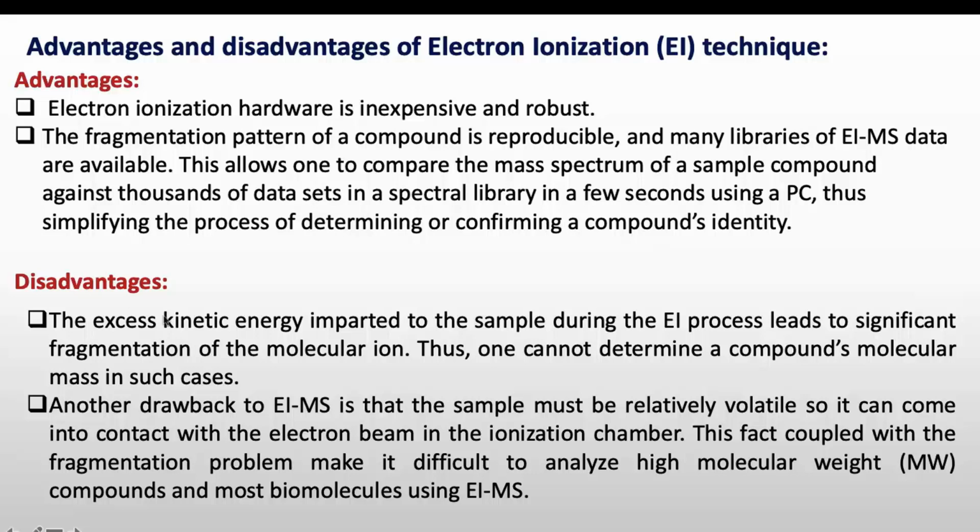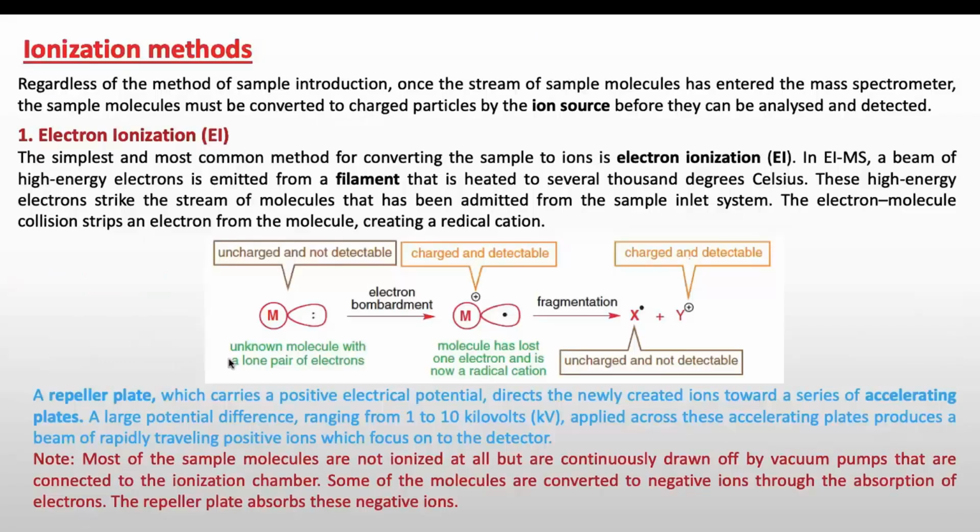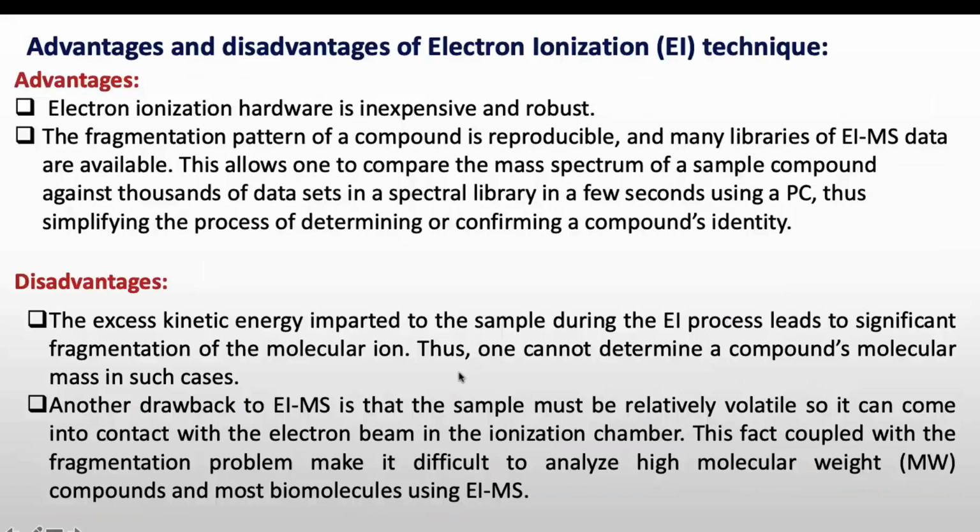But this method also has a few disadvantages. The excess kinetic energy imparted to the sample by the electrons during the EI process leads to significant fragmentation of the molecular ion. That means it does not stop at ionization; it goes further towards fragmentation. Thus one cannot determine a compound's molecular mass in such cases. Another drawback of EIMS is that the sample must be relatively volatile, so it can come into contact with the electron beam in the ionization chamber. This fact, coupled with the fragmentation problem, makes it difficult to analyze high molecular weight compounds and mostly biomolecules using EIMS. So these were the disadvantages of this method.